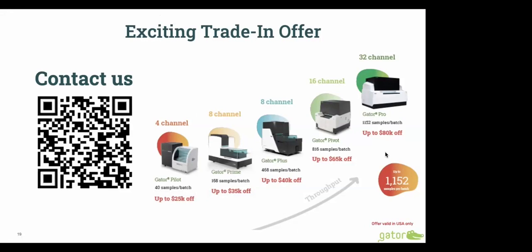The next question is, what is the regeneration buffer used for the anti-VHH sensors? Yeah, the regeneration buffer is our standard regeneration buffer, which is a low pH buffer. So these probes can just be exposed to that low pH buffer, and that helps with regeneration. This is on our website as well. It's our standard regeneration buffer. And I'll echo that. That's what we use as well.